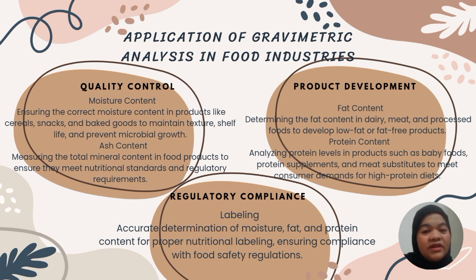Next is the ash content. Ash content is determined by measuring the total mineral content in food products to ensure they meet nutritional standards and regulatory requirements.